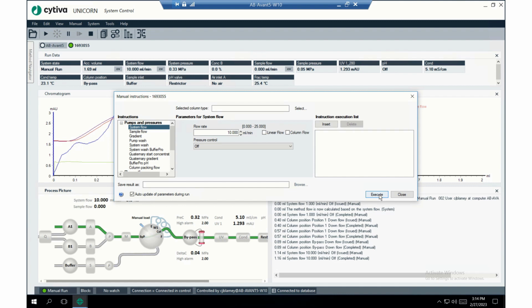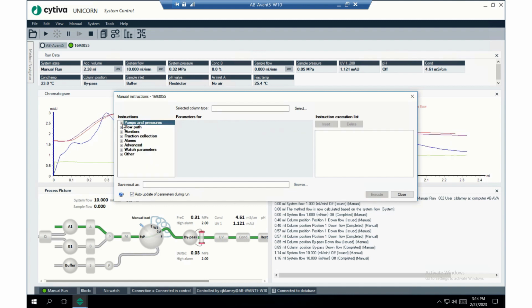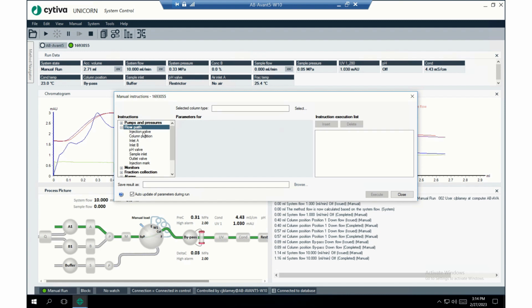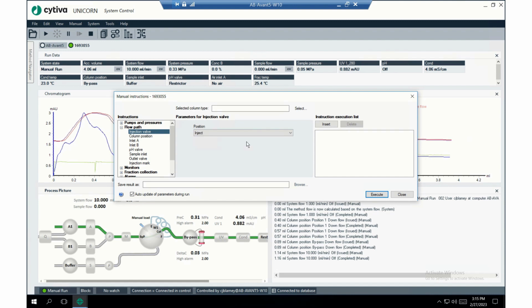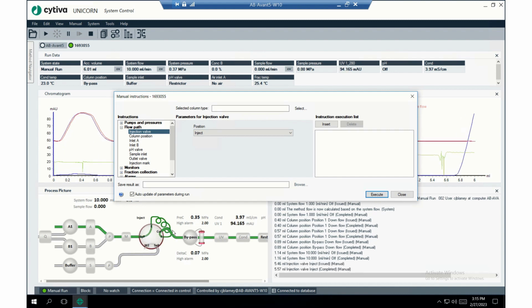Okay, then we're going to go to the injection valve in the flow path and select inject. There we go. The idea here is to get all of the air out of the sample loop. And we'll let that run for a minute or two. You can see it's running through the sample loop right now.